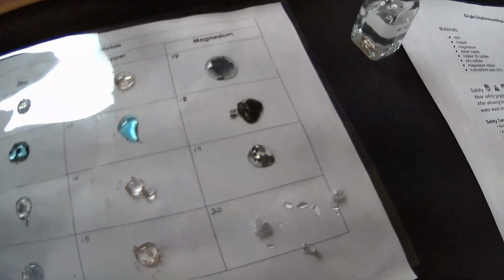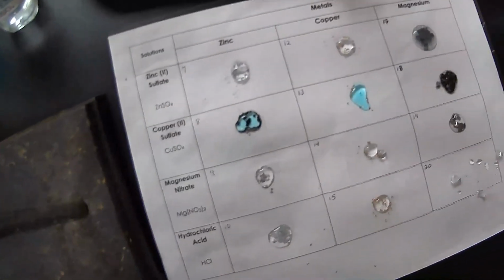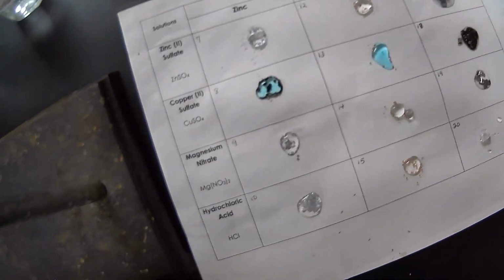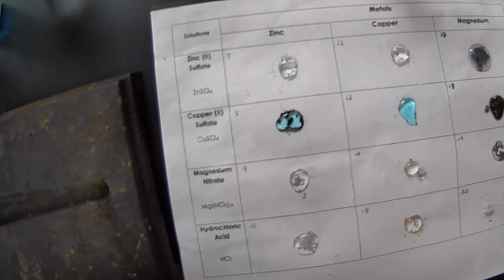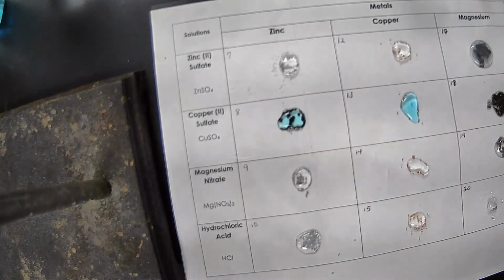Okay, so we had several that were no reactions, and then a few that I did have a reaction. So hopefully you were able to write that down in your data table. If not, go back and rewatch the video again. All right, so I will go ahead and clean this up for us.